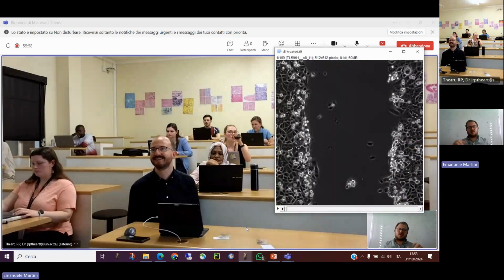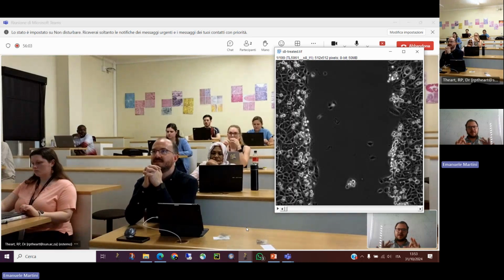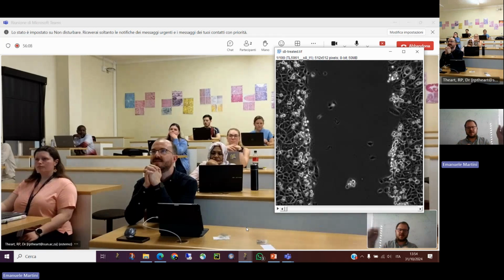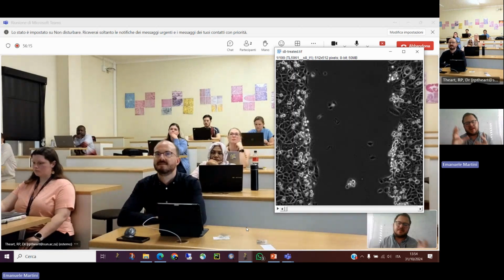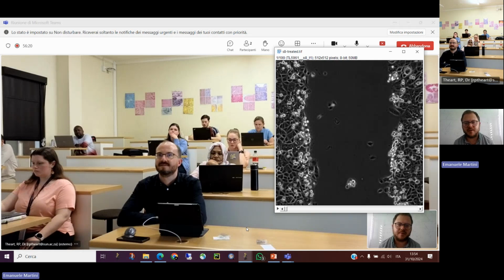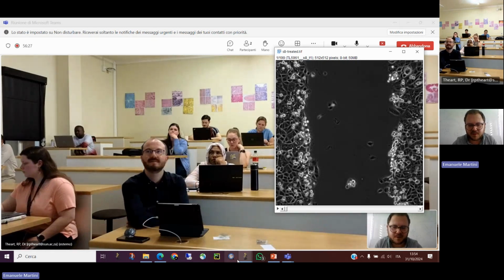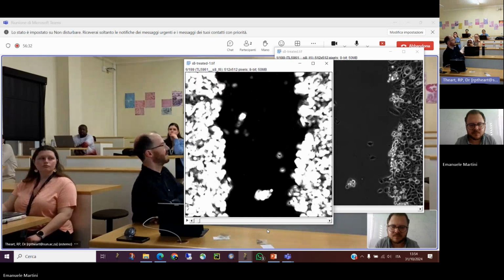Yeah, this experiment, this hands-on, is also thought of as quite an easy analysis in a certain way, very basic filter and thresholding, but it will tell you how to deal with the image stack. I like it because it gives you a little hint of doing stuff also without a fluorescence marker, so you will see some slightly different stuff. Everybody has put the filter. Is everybody happy that the filter applied? Cool, yeah. Thank you, Ken.